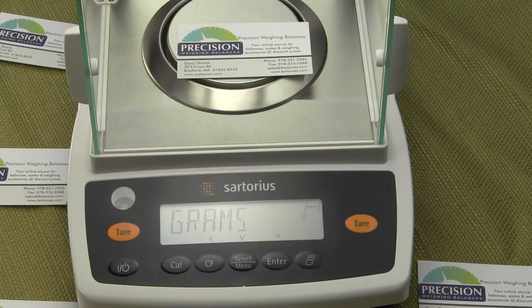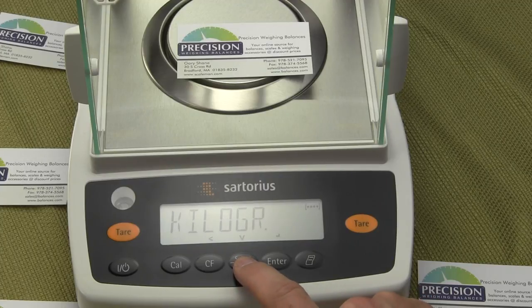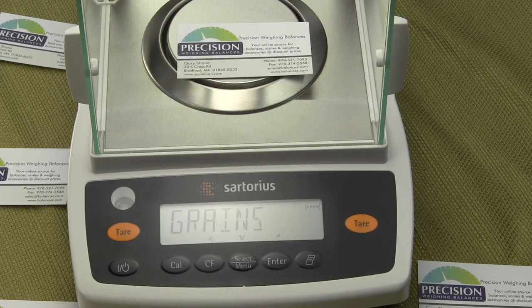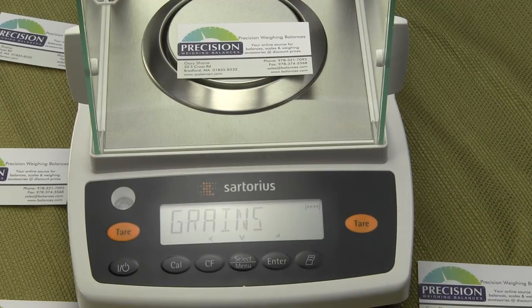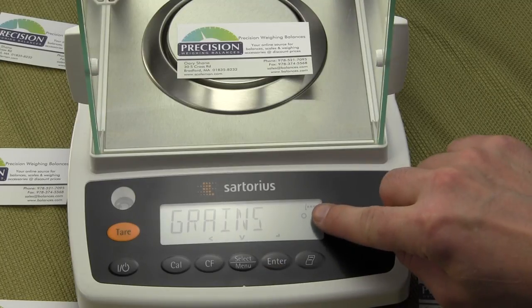To change it to grains, press the select menu button to toggle through the available weigh modes. You'll cycle through kilograms, carats, pounds, ounces, troy ounces, teal, Singapore teal, Taiwan teal — and then grains. That's what you want if you're a gun and ammo person. To store that value, press the enter key. You'll see a circle appear next to 'grains,' indicating that value is now stored.